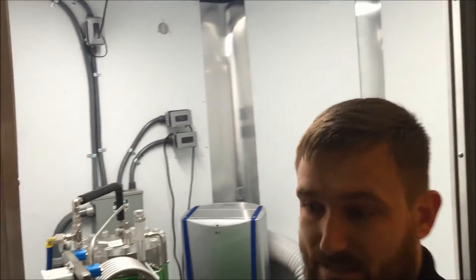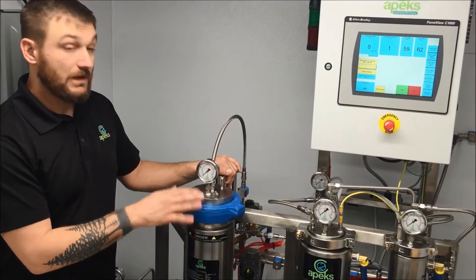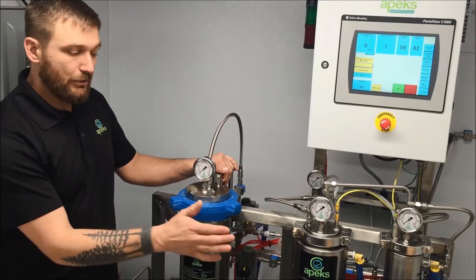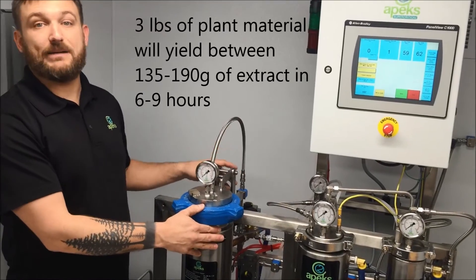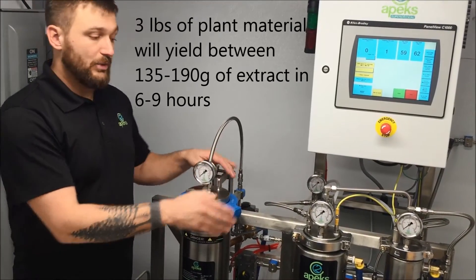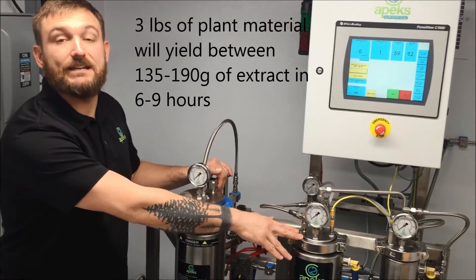Let's go back around and take a look at the system. This system will process at a rate of two to three hours per pound of material. So if we load three pounds of material in here, it'll take approximately six to nine hours to process that material with a resulting yield between ten and fourteen percent.